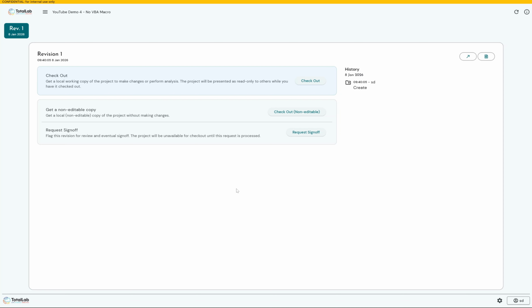But what you can do is, if you're working off templates, for example, you can create a template in just a normal version of Excel outside the compliant environment, create that template, lock down the cells that you want to allow to be changed, and then bring it into AuditSafe as the template for all of your staff to work from. And we will respect the kind of write permissions that were initially on the spreadsheet. So if you marked, there should only be 4 boxes that can be added to or taken away, we respect that. So even when it's in AuditSafe, there's still only 4 cells that can be changed.